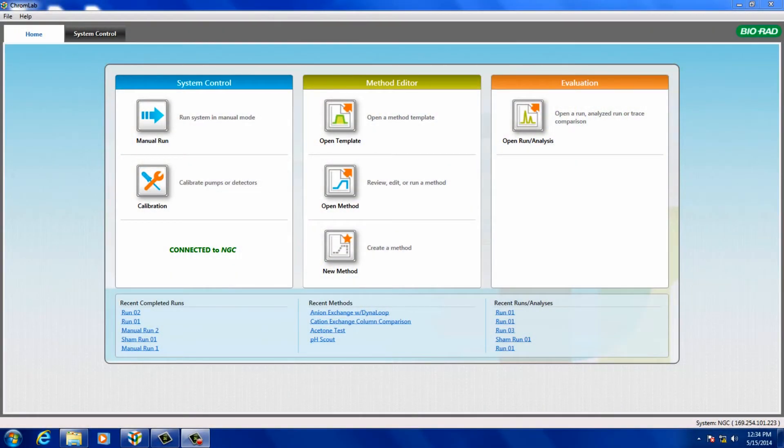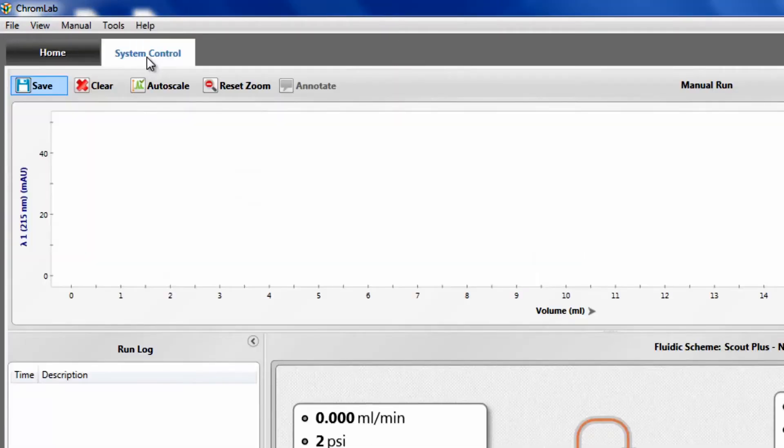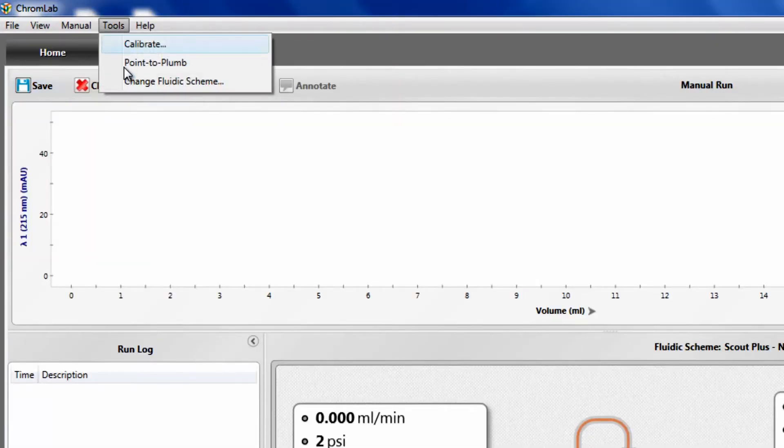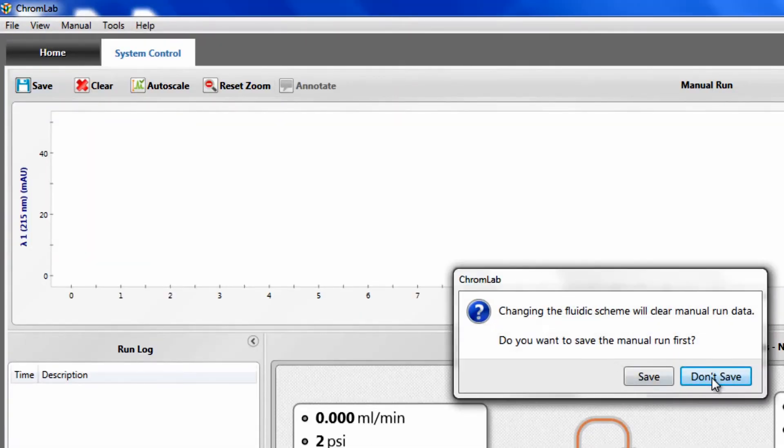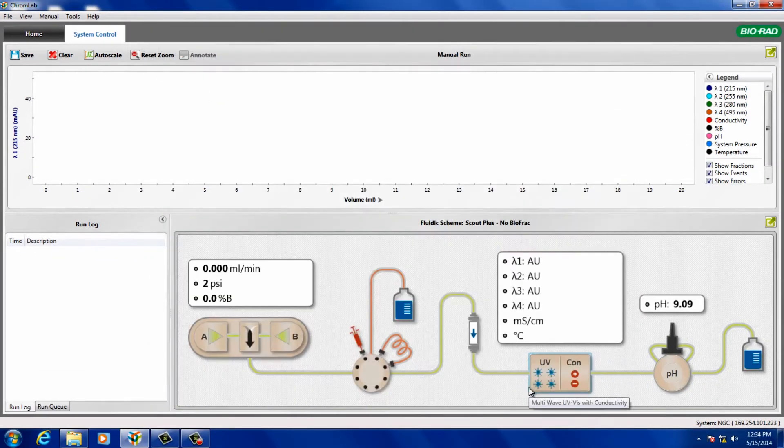Next, use the Chrome Lab software to activate your pH valve module. Under System Control, Change Fluidic Scheme, select or create a fluidic scheme that includes the pH valve in the flow path.